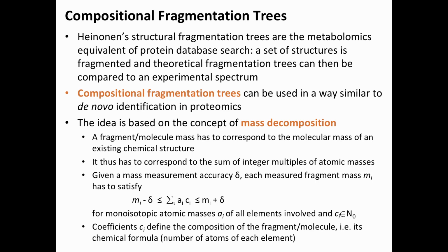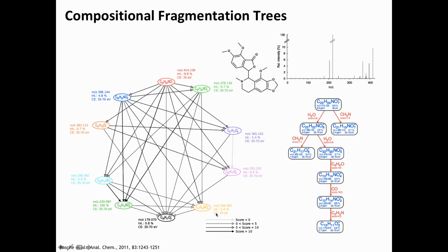And remember what we saw about the mass distribution. All masses are not created equal. Every one of these masses can only be made up from different subcompositions. So that's a reasonably well-known problem, you can just take these masses apart and come up with a way to decompose them. So let's look at that. I hope you can read that from the back.